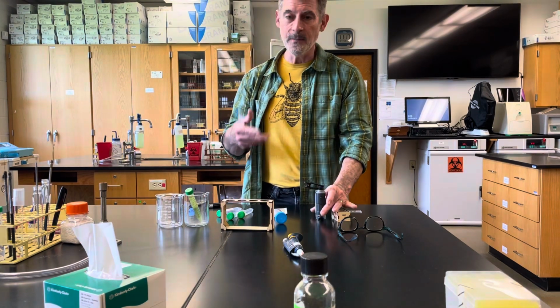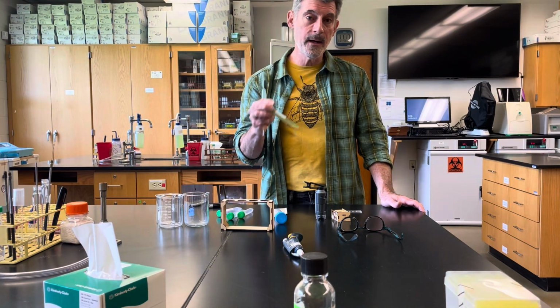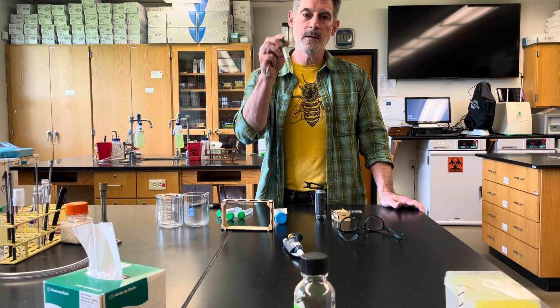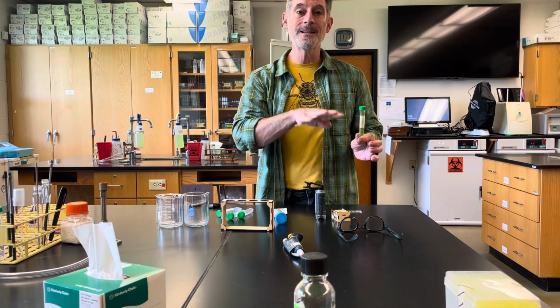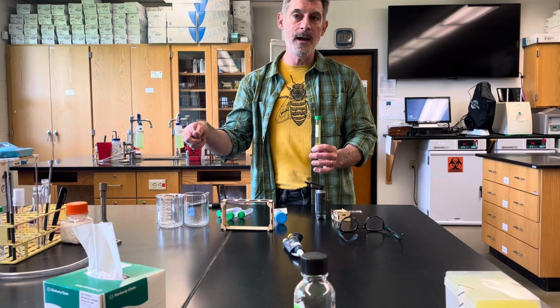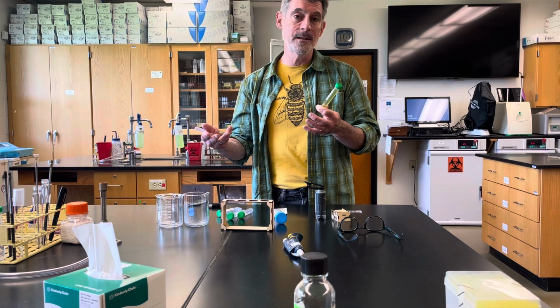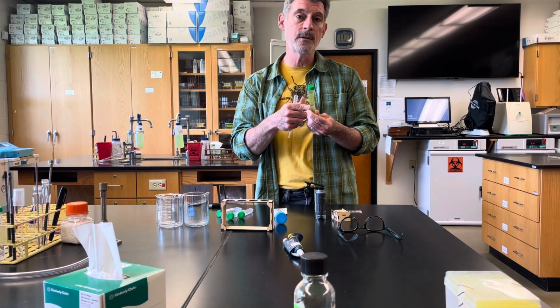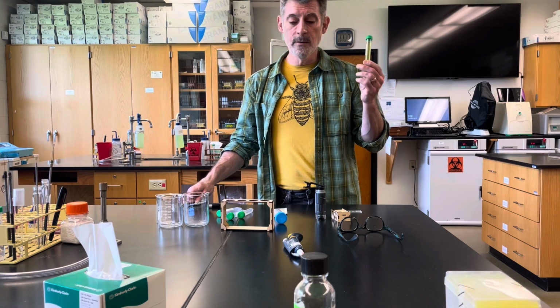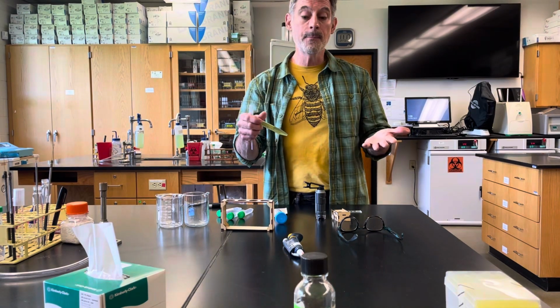So in this experiment, you're going to be getting a culture of algae. When you pick up your kit from the college, you should get a little tube like this. It's going to be sitting separate. There's a test tube rack that they're sitting in. They're not in the bag. You have to get this tube and pick it up because we need to get it as much light as possible. They're live algae cells in here, green algae called Tetraselmis chui. So you're going to get this, bring it home, and then set up your experiment.